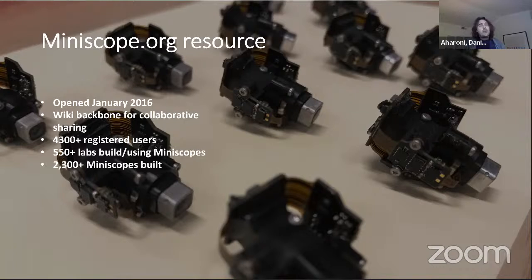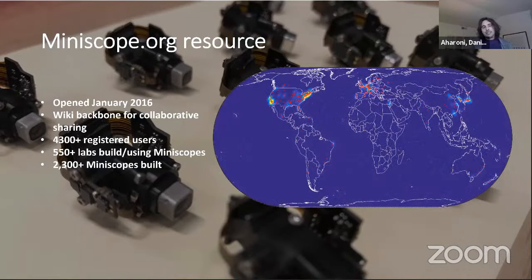So pretty early on in the project, we decided that we really wanted to make all of the work we're doing open source and really invest our time to making sure that it's not just open source in the title of the project, but that we are really enabling the neuroscience community to be able to use these tools. So in 2016, we opened up access to our first design of a miniature microscope. Since then, I think the number is probably closer to 3,000 miniature microscopes have been built. Again, this is an open source project, so we can't really keep track of all the miniature microscopes that people build, because someone could go to their university machine shop and get the parts machined and go to their favorite PCB fabrication house and get the circuit boards made. But of what we know, we're probably in the ballpark of 3,000 Miniscopes.